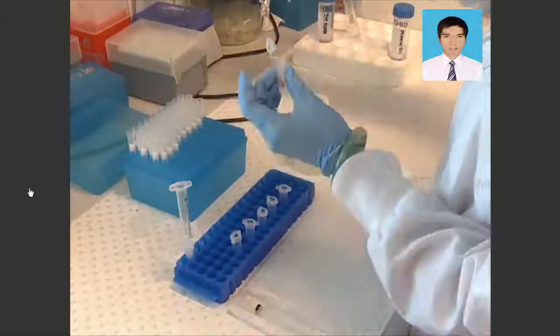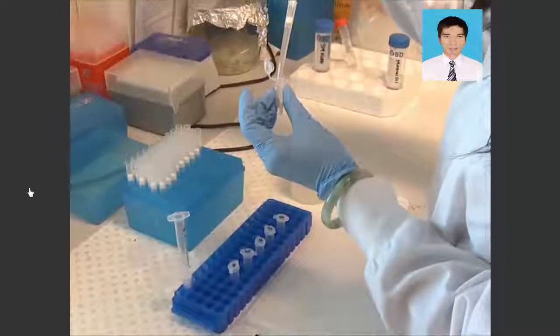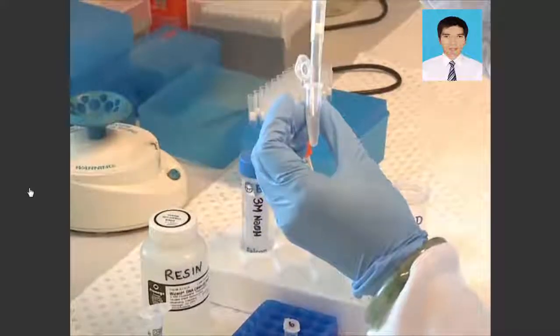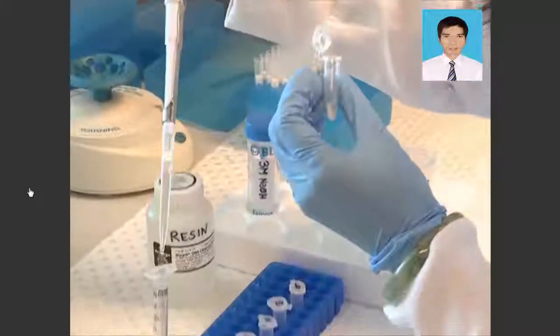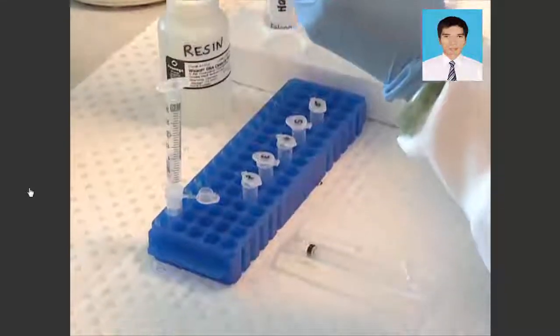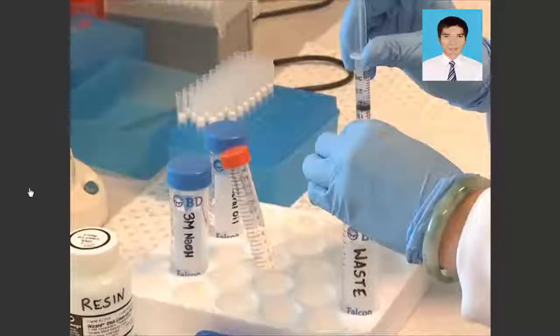For the next steps, our lab uses the Promega Wizard DNA cleanup system. Add 1 mL resin to the DNA samples, invert the tube to mix, then pipette the solution into a syringe attached to a desalting column.